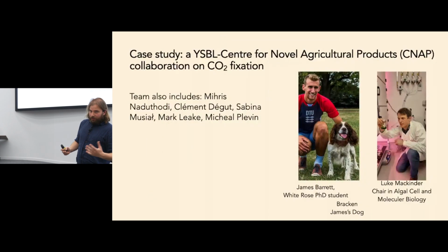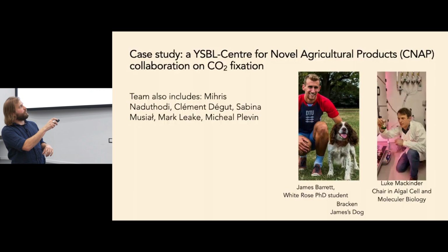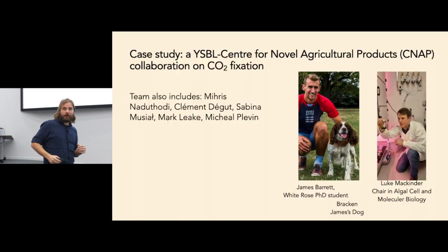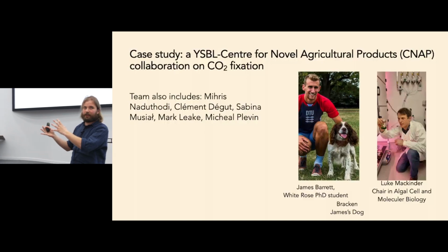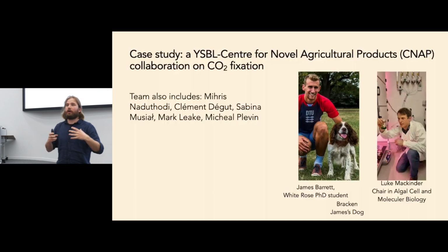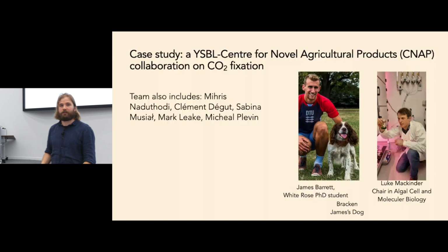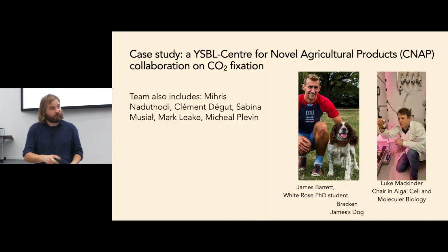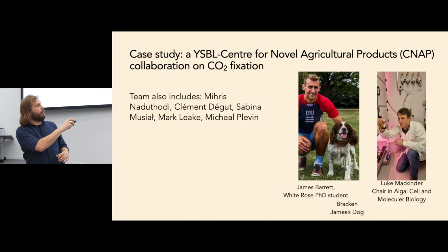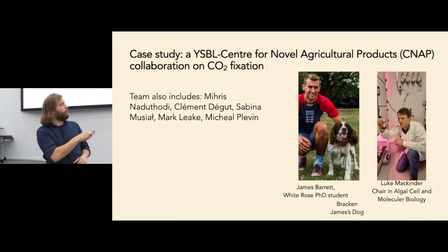But for the case study, particularly if we have Richard from the Medical Research Council, I thought I'd pick something which is a collaboration between YSBL and the Centre for Novel Agricultural Products, partly because this was in the plant science and sustainability space, partly because it's just a really nice example of how, when you have 2 excellent research centres on campus, they can work together to have even more effect. Now, this paper actually included other contributions which weren't cryo-EM based, particularly Michael and Clement, who used the NMR machine, and that went in.